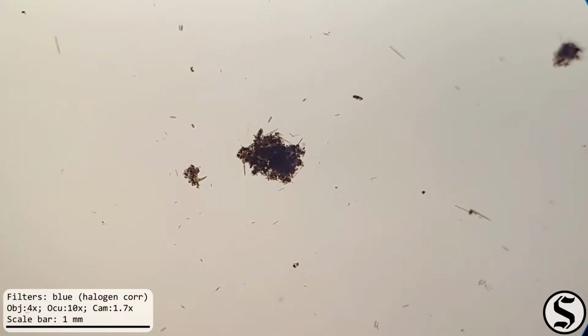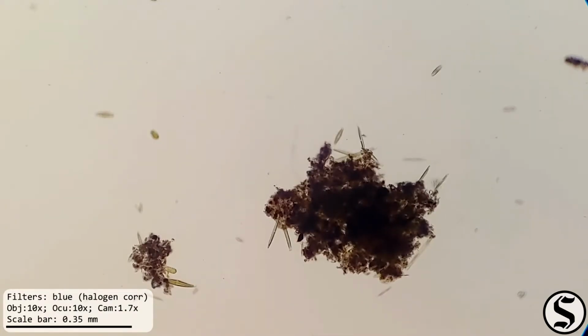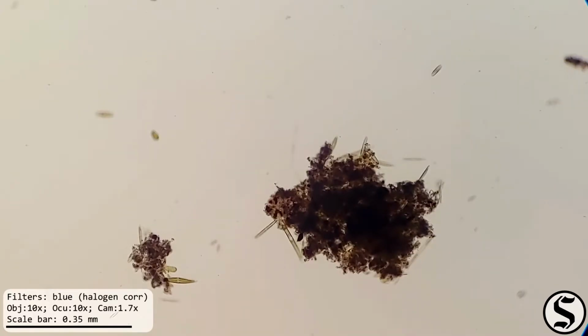Under the microscope now, that stuff doesn't look nearly so slimy. We can see some small rods. And now at slightly higher magnification, we can see that these are diatoms. Diatoms, if you recall, are of the class Bacillariophyceae. That comes from the Latin bacillus for little staff, and the Greek phykos for seaweed.